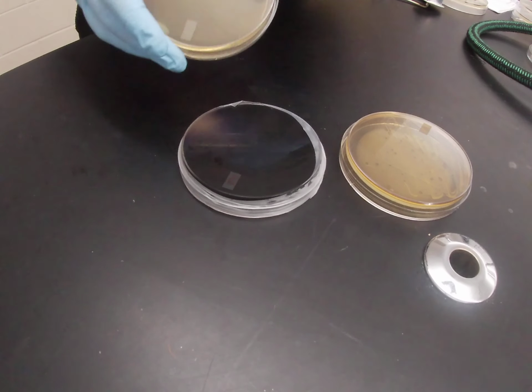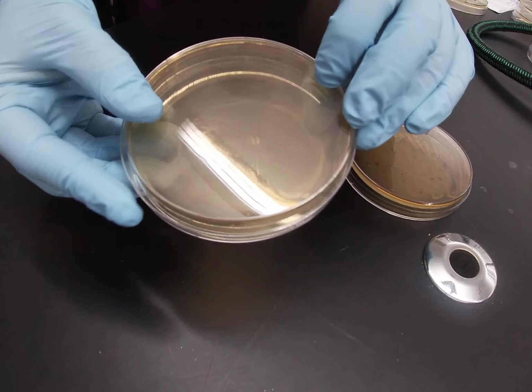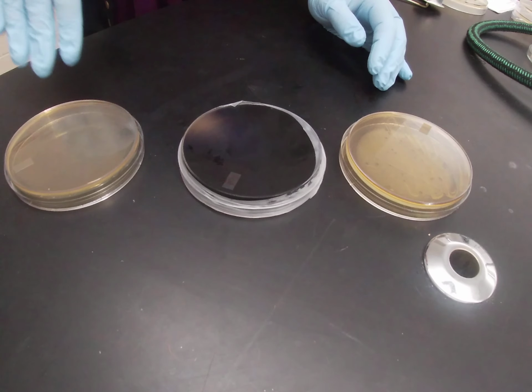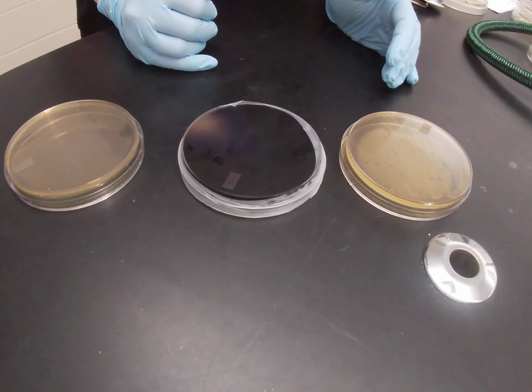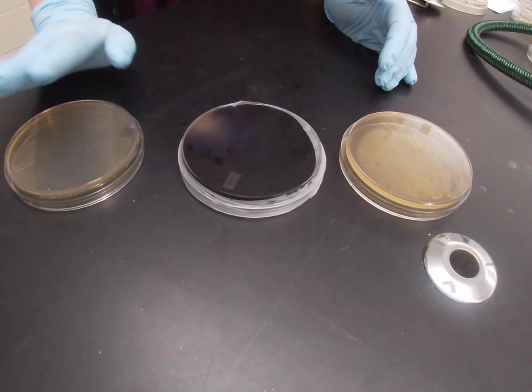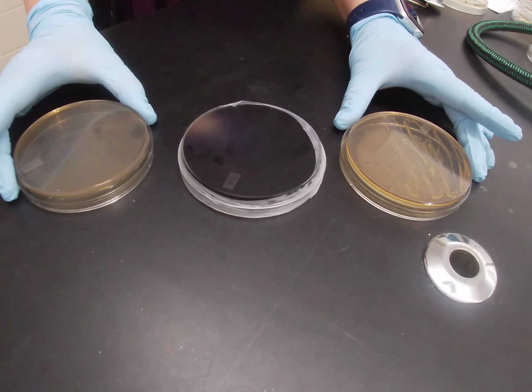Here you can see an uninoculated Bile Esculin plate. They are darker than a nutrient agar, but kind of tan and translucent. The selective materials in a Bile Esculin azide agar are bile salts and sodium azide. Sodium azide is inhibitory to all gram-negatives. So sodium azide is what causes our gram-negative organisms not to grow on this plate, whereas bile salts are actually inhibitory to a lot of gram-positives. We will see bile salts in a lot of our different plates that we use for our gram-negative bacteria.